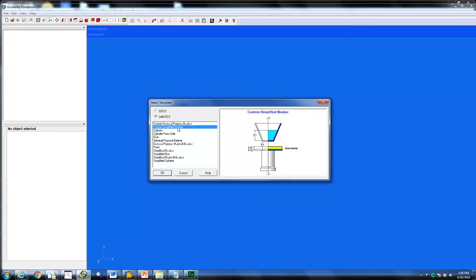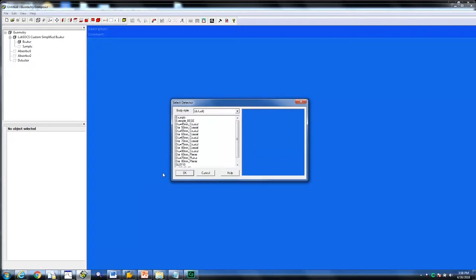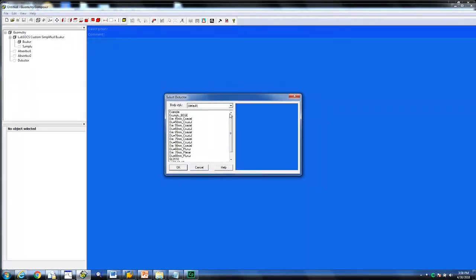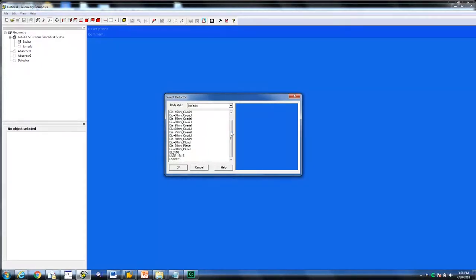The general purpose beaker allows you to define two different layers of radioactivity. The second step is to select the detector we are going to be calibrating. Scroll to the bottom to select the Sage Well Example file and click OK.